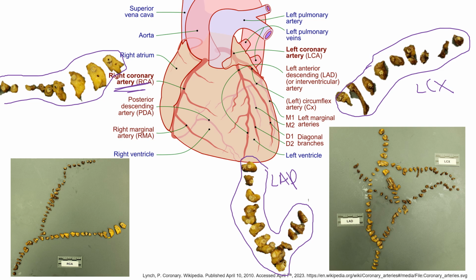So we use these for just very stenotic vessels that you can't really cut through accurately with either a blade or a pair of scissors. And then it can give us nice cut sections, and you can see how marked this atherosclerosis is here. So this looks like 90% here. We've got an occluded vessel here, and again, bordering on that 95 to near occlusion in this vessel. So very severe coronary artery disease.